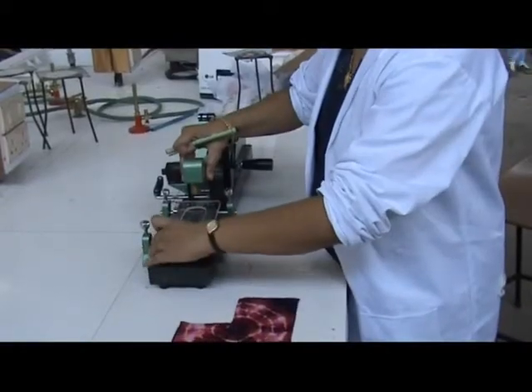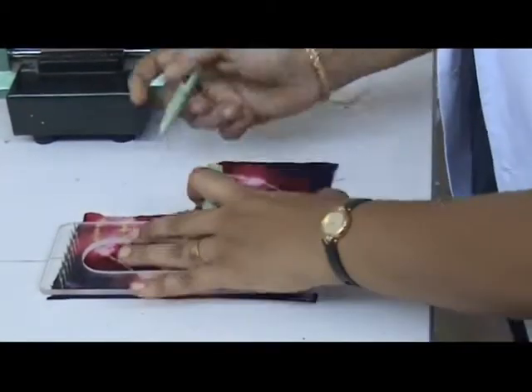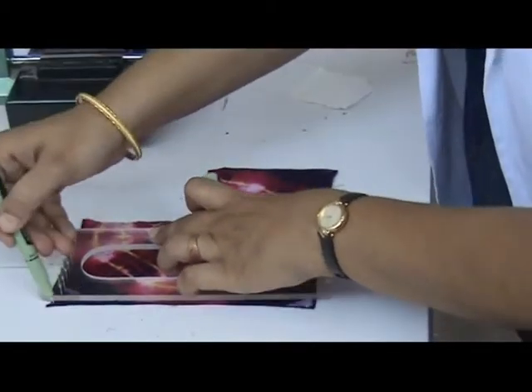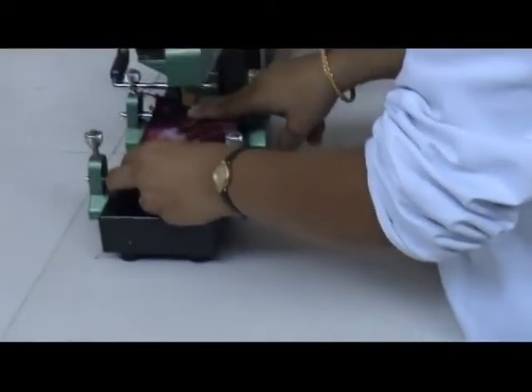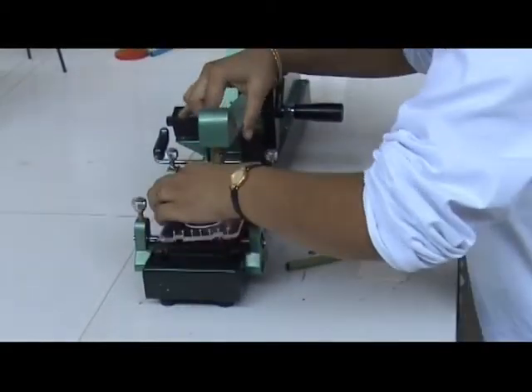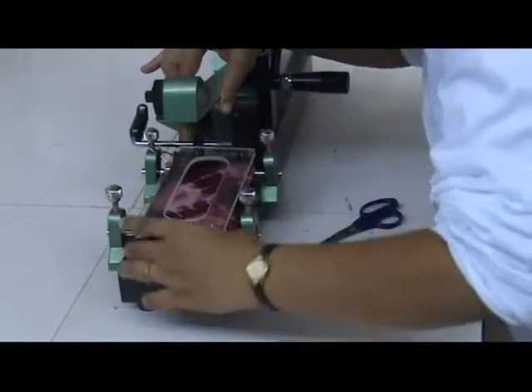Two pieces are also cut for wet rubbing. One specimen of each pair is cut in the warp direction and the second in the weft direction. In the case of yarn and fiber, combing is done to get a sheet of 14 centimeters by 5 centimeters. The test specimen is then fixed onto the crockmeter by means of clamps.